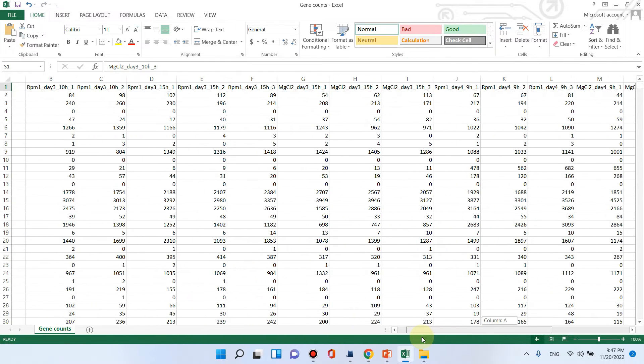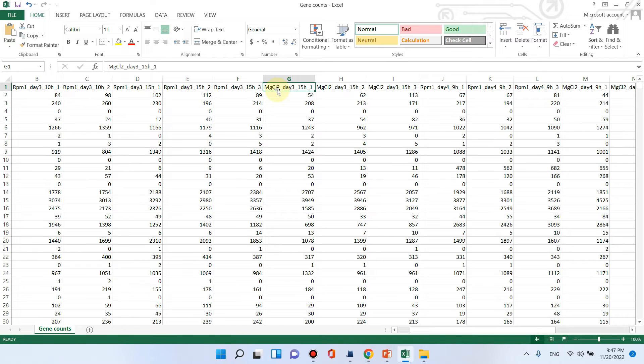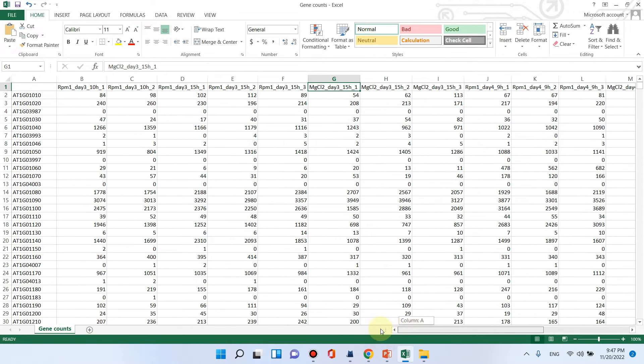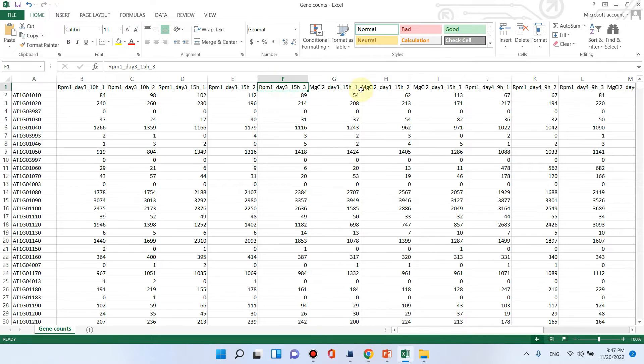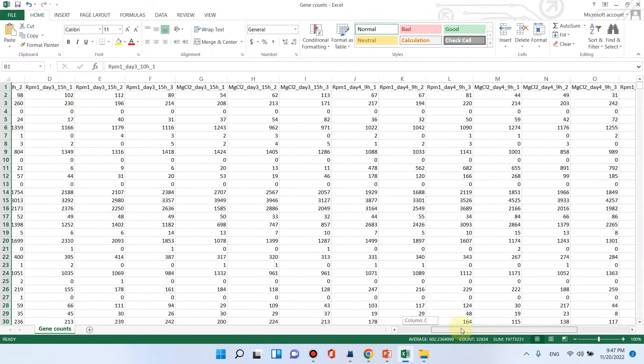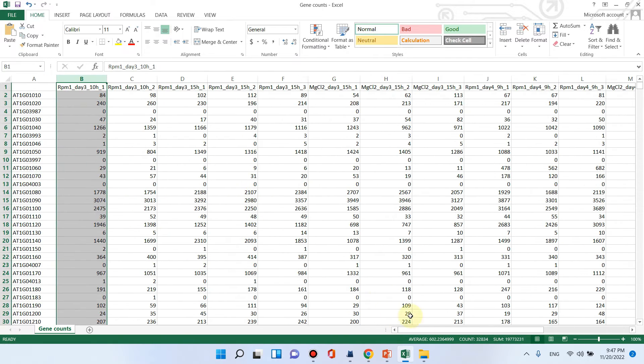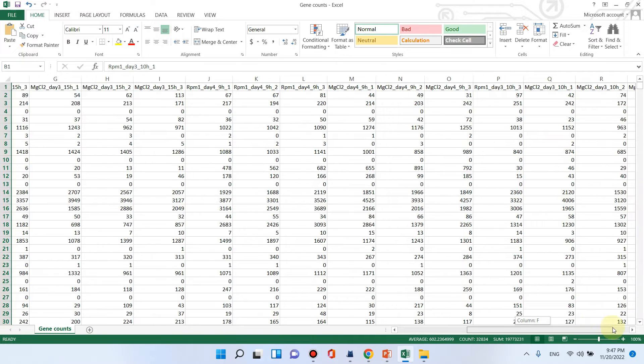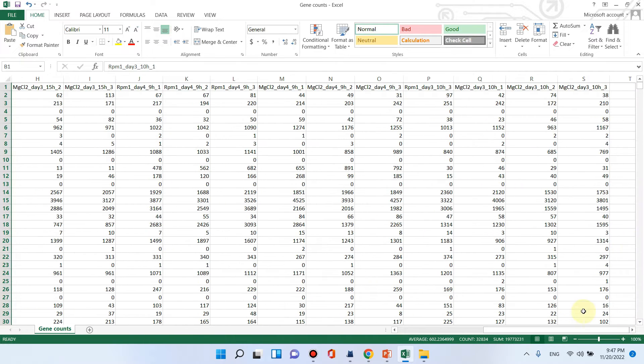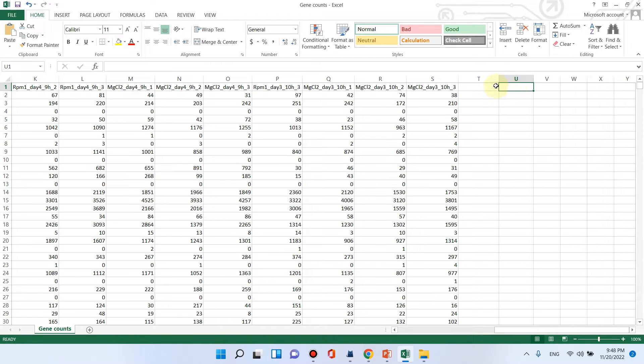Actually in this experiment they have used two treatments, one is RPM and the second is MgCl2. They applied RPM and MgCl2 on the leaves of Arabidopsis plants and checked the growth and compared the RNA-seq data at different days. You can see here in all the columns only the gene counts data is given. You can also give your read counts data from your experiment but you don't need to give at the end like any log FC value or p value. After the gene counts data all the columns are empty.